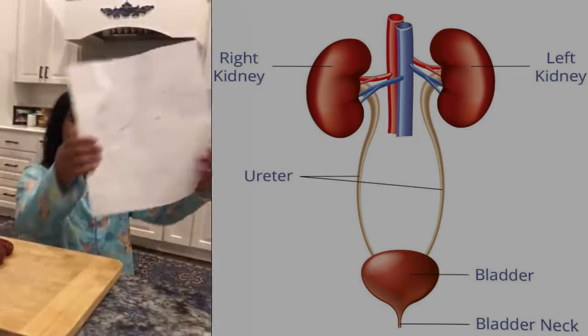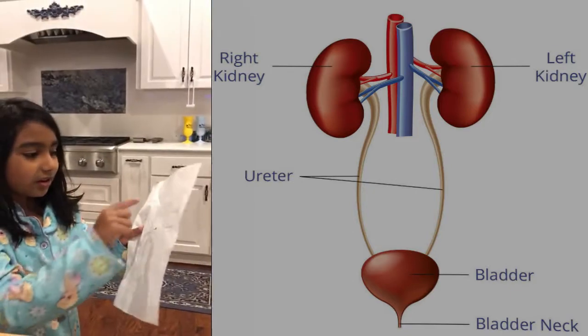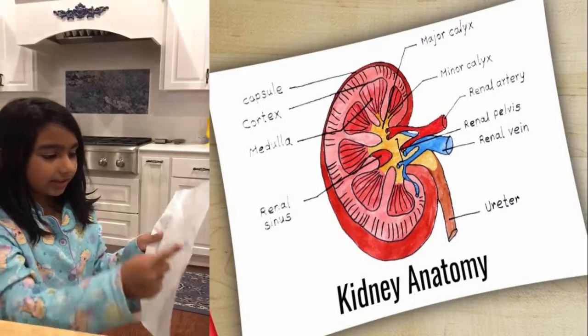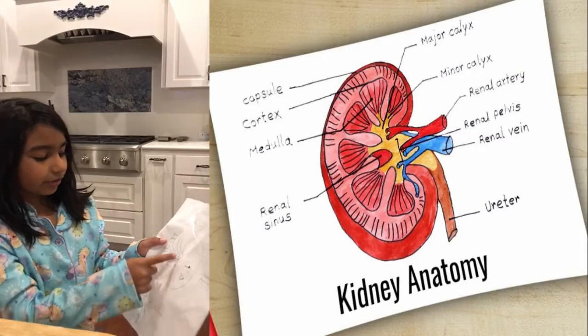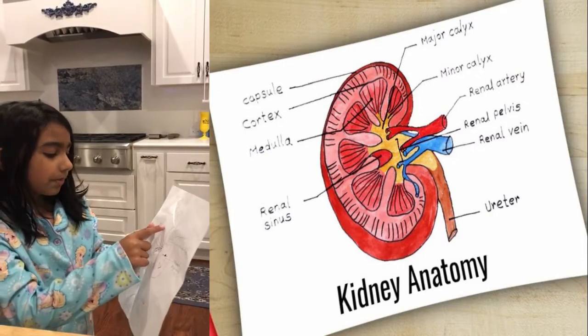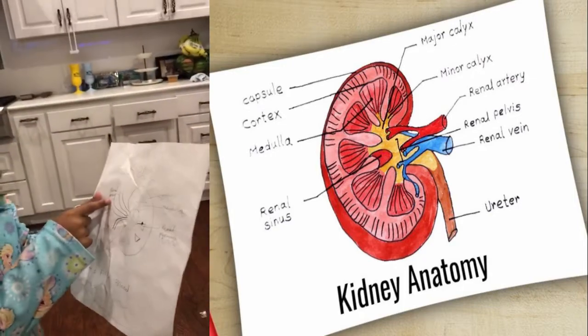So this is how the goat kidney looks like from the inside. There are three layers: cortex, medulla, and pelvis. And these are the renal pyramids. They filter the blood and the urine comes out here at the ureter. So the bad blood comes in here and the good blood goes out there.